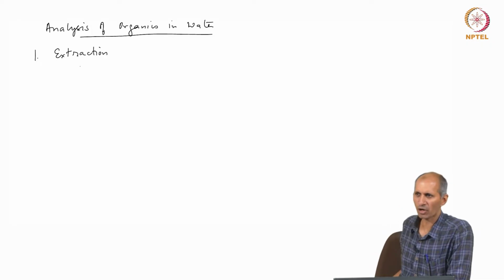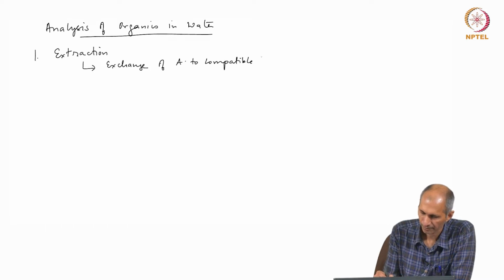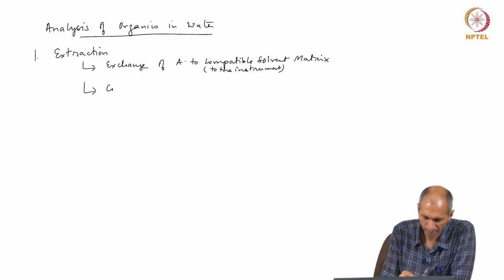As you recall, the objectives of extraction are use of a compatible solvent, so exchange of A to a compatible solvent matrix. This compatible means compatible with the instrument. Second, it gives you an opportunity to concentrate the sample.